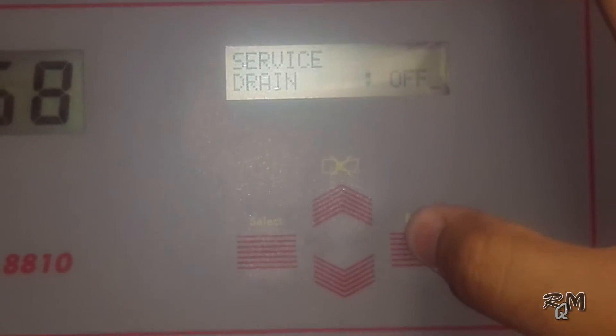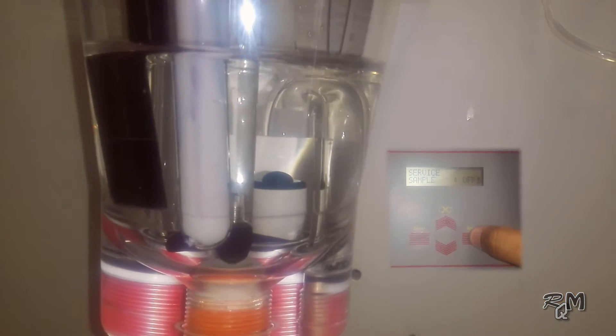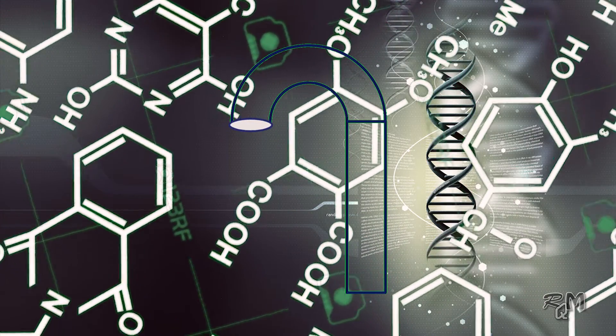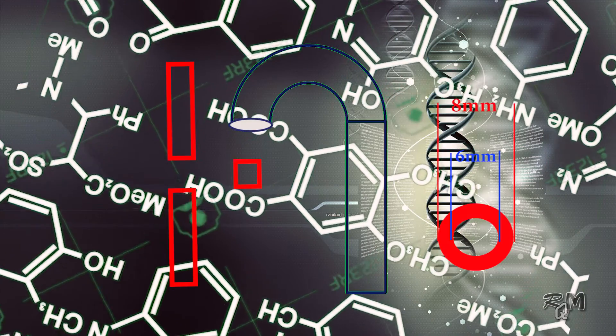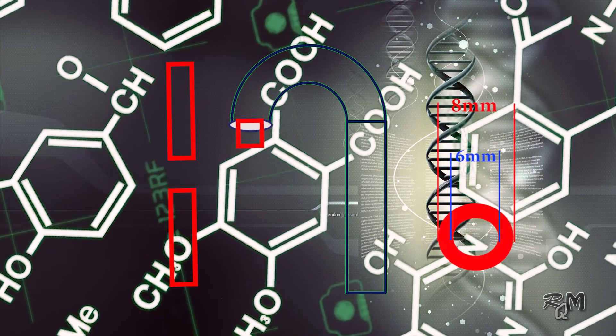Enter the sample valve menu. Switch on the sample valve and observe the inlet sample level — it should reach the mouth of the overflow tube within 10 to 20 seconds. This will ensure that the inlet sample flow is sufficient. Then switch off the sample valve and verify siphon activation. If the siphon is not activating properly, reduce the siphon tube entrance with the aid of a 2 cm long piece cut from an 8 mm tube with an internal diameter of 6 mm. Insert this piece of tube into the mouth of the siphon tube. After that, position the sprinkler at the level where it can spray rinse water uniformly on both electrodes.